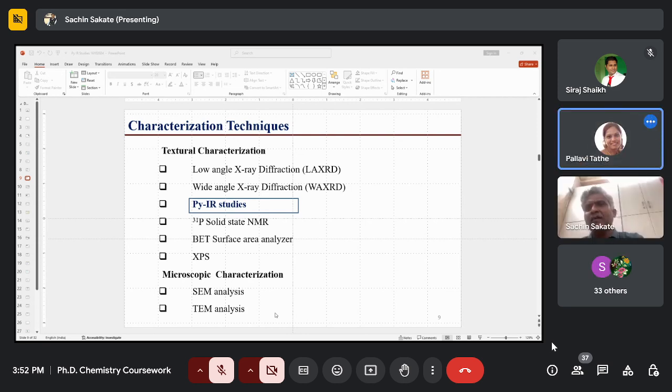To know surface area? Yeah, we are doing surface area analysis because it will give us the idea of what the surface area of the material is, and it will have very good dispersion. But why do we need pore size analysis, pore volume and diameter?